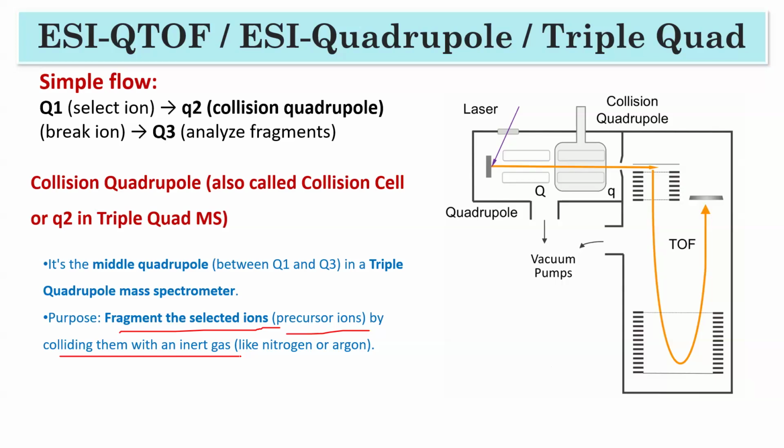If we just look at the protein, we may not know what amino acids were present. So if we use a triple quadrupole with the collision quadrupole, the smaller q, you can fragment and send them to get the mass spectra, and you may find what kind of polypeptide and amino acids are present in your protein.